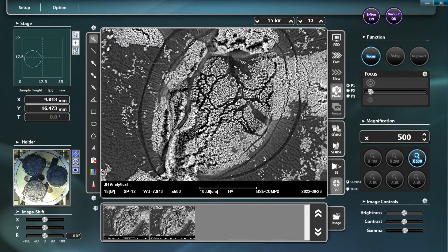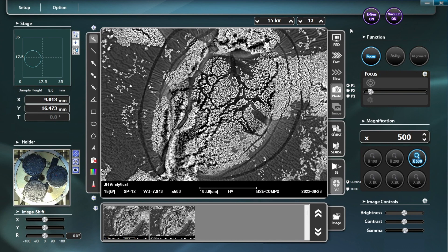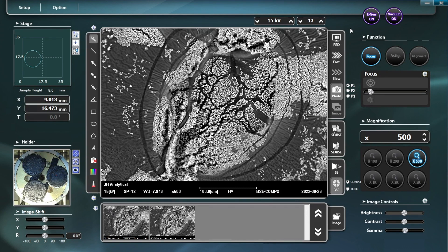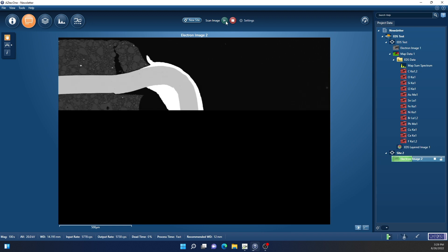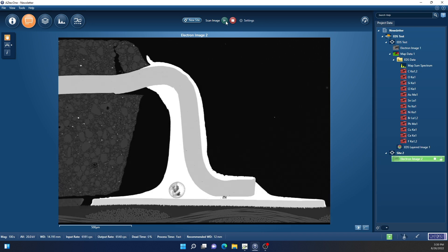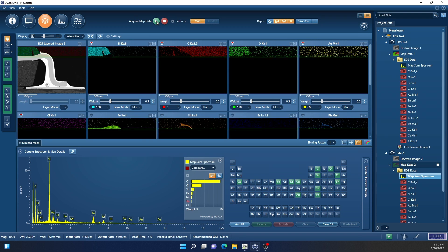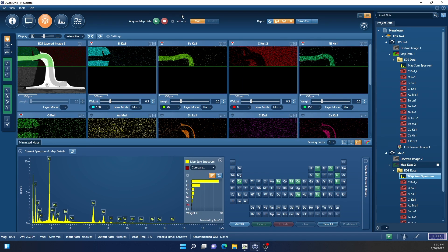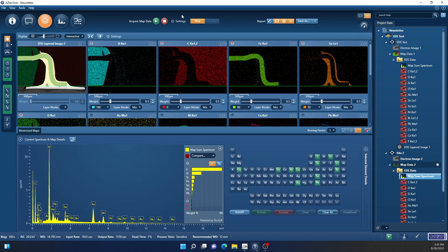The system's backscatter electron detector is used to obtain high resolution images of the elements present in a sample, providing greater contrast and additional information about that sample. Energy dispersive x-ray spectroscopy, or EDS, makes the system capable of capturing information about the chemical makeup of your sample, providing robust elemental analysis.